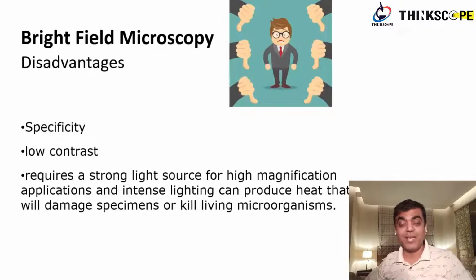But yes, limitations are there. As the stain goes and binds, specificity is a little low compared to molecular or target-oriented specificity. Here specificity is pretty low. It binds to overall, larger areas. Contrast at times is difficult. For example, if you are working with diatoms, you will not be able to do it with Brightfield. In that case, staining is not possible. Suppose you are working with flagella or bacteria, even if you stain them, getting resolution when working with Brightfield will be a little difficult. You will not get all the details out of it.